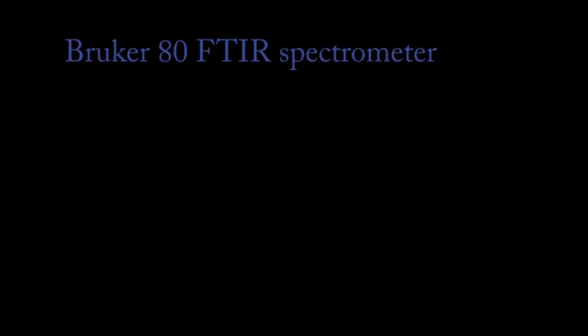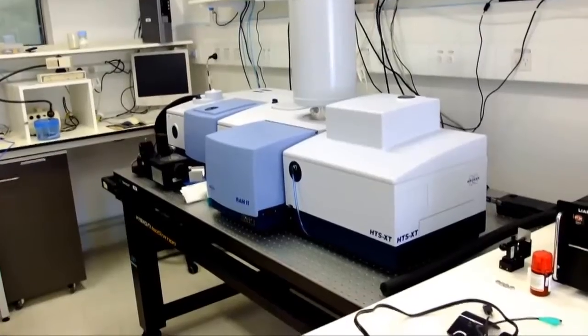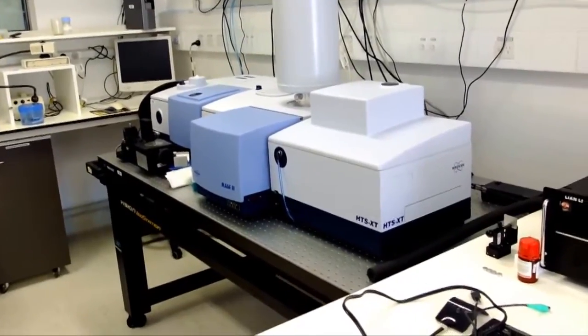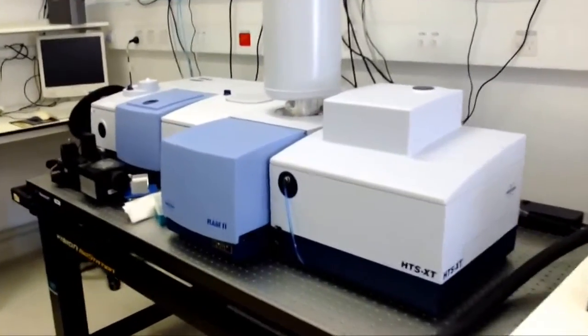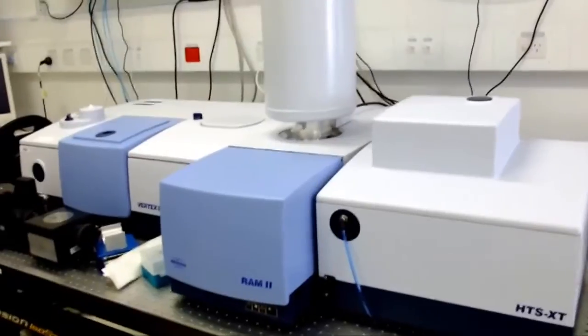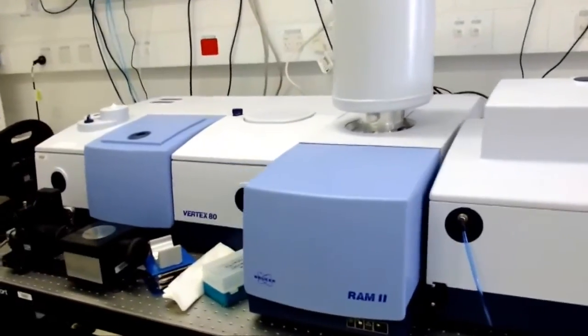This is a product overview of the Bruker 80 FTIR spectrometer. It's shown here with a couple of accessories. There's a high throughput sampling accessory called the HTS and a RAM 2 module.